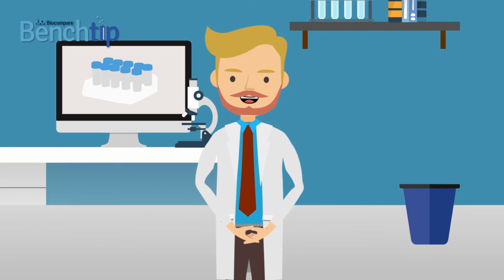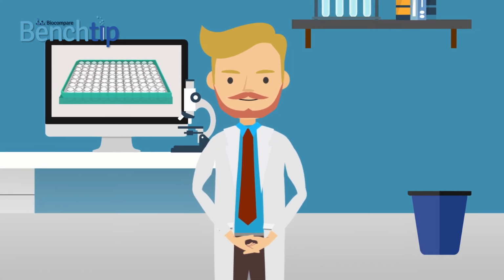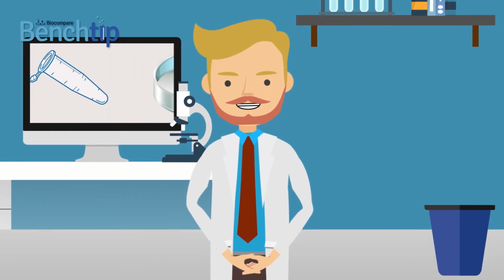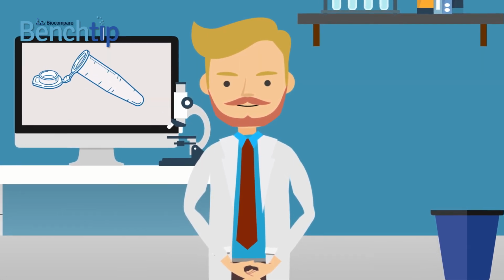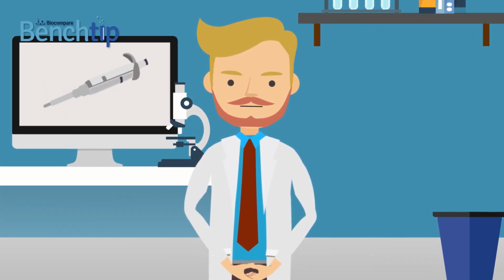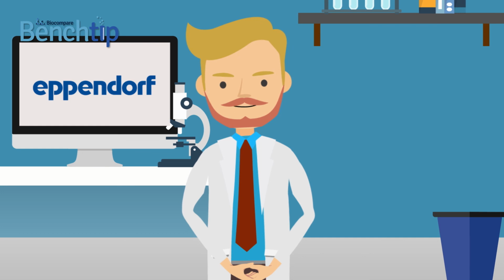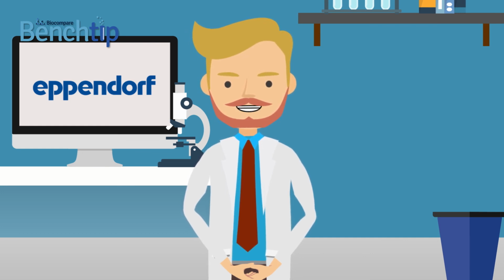No plastic can ever be entirely free of leachables, but using laboratory consumables from quality sources greatly reduces risks associated with plastic labware. Using laboratory consumables from companies like Eppendorf lets you work in confidence and spend more time thinking of your experiment and less time worrying about leachables.